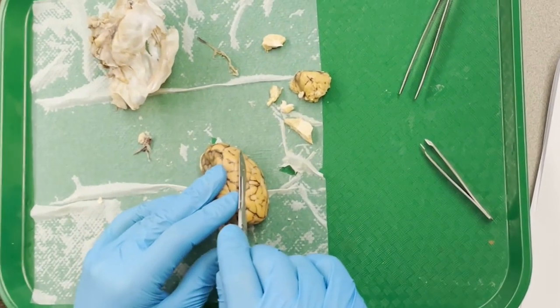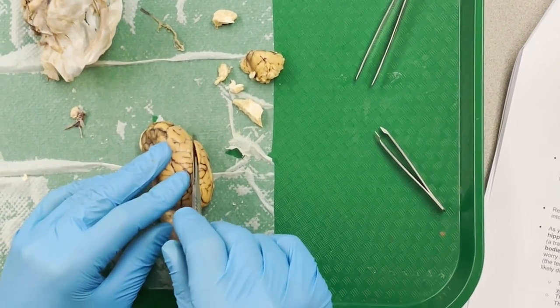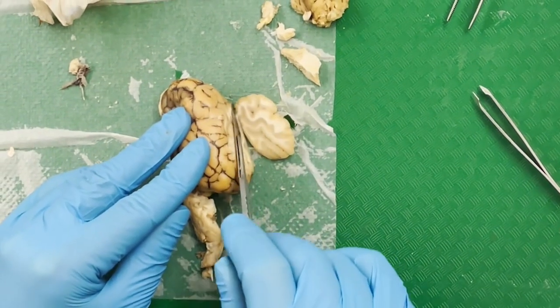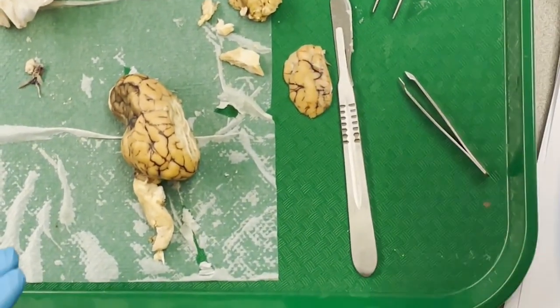I'm going to make a straight vertical cut, cutting off, let's say, the top centimeter of the brain. I am bad with measurement. Could I actually, let me take this knife.